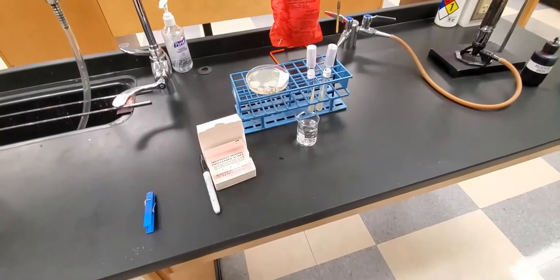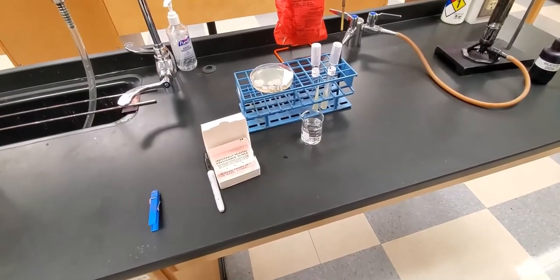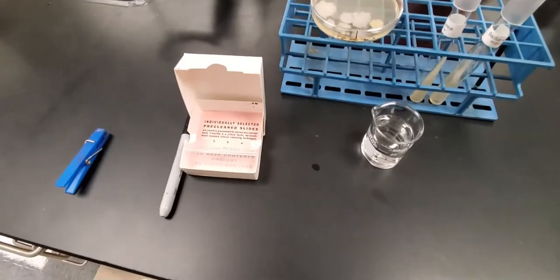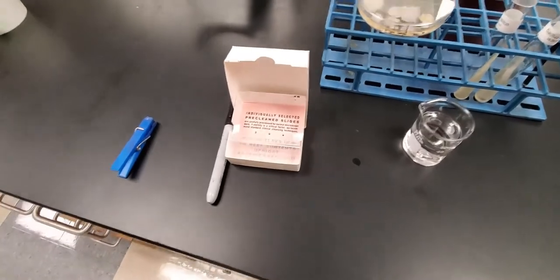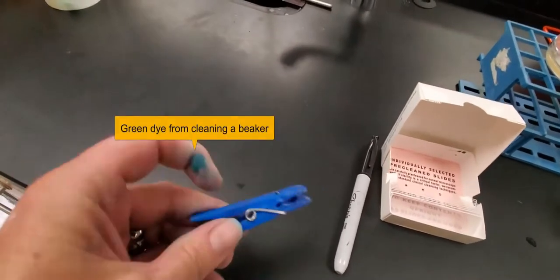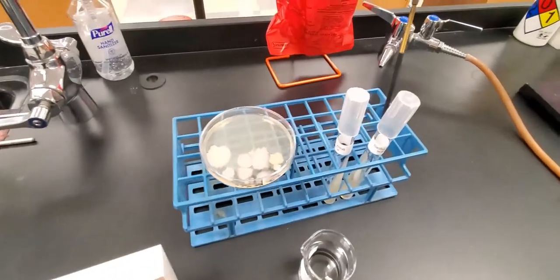In this video we're going to take a look at the endospore stain and we'll need a couple of supplies. As usual we need our glass slides, sharpie to make some labels, your slide retention device, your cultures, and your loop.